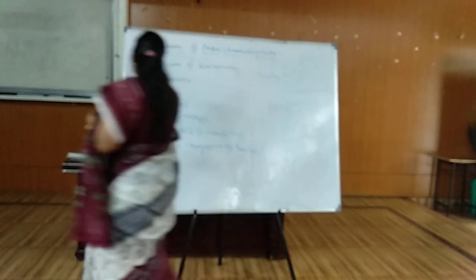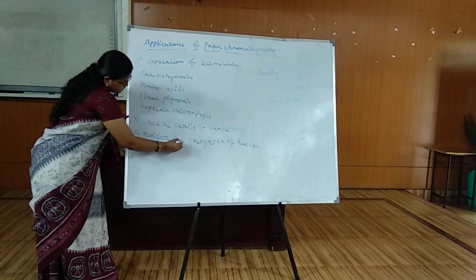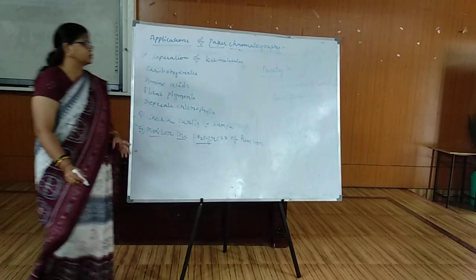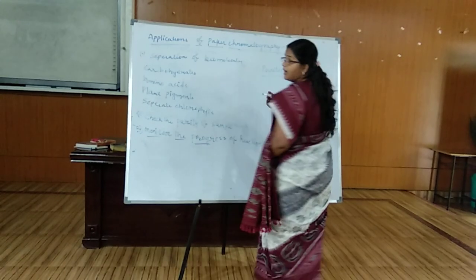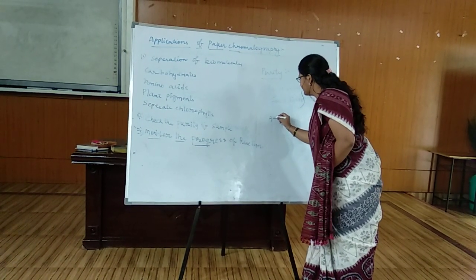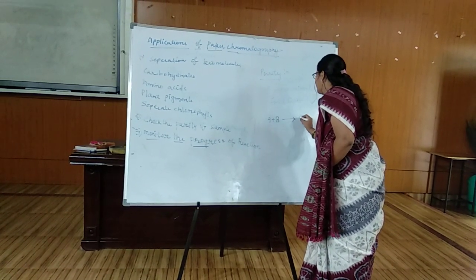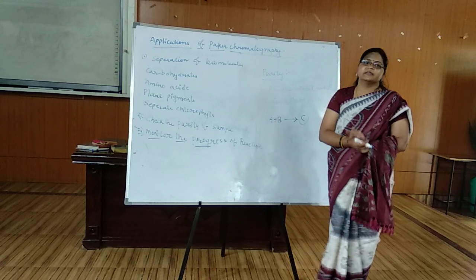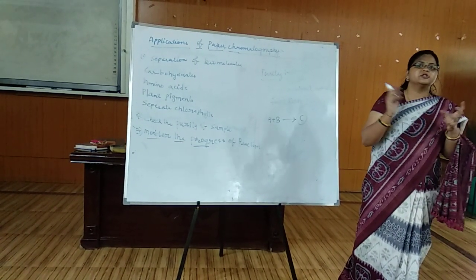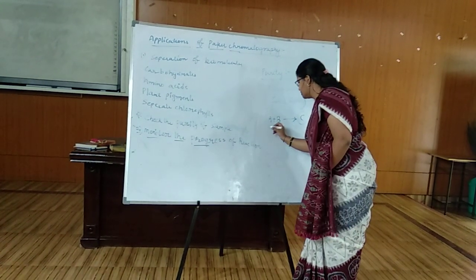Now we will see how to monitor the progress of a reaction. How can we do that? Suppose I am taking two reactants A and B. They are combining to give you a product C. Suppose this is our reaction.